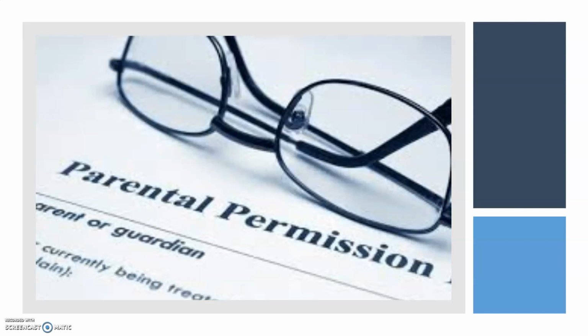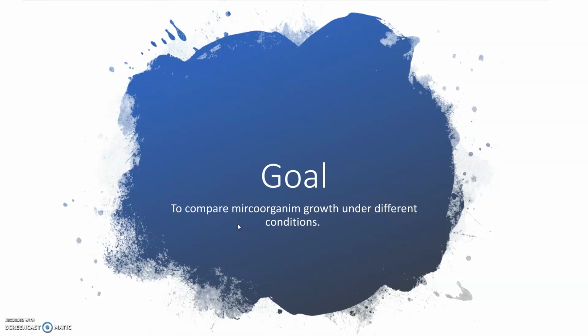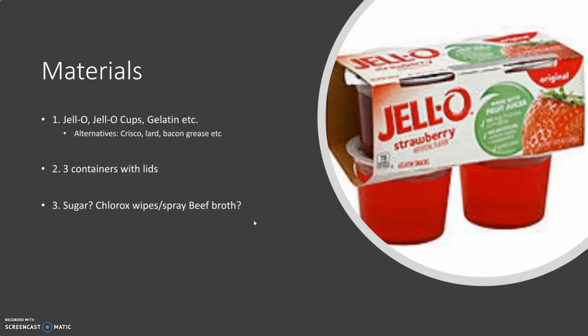The sooner the better, because this will take a few days to get through. I think the time-intensive part will be the beginning and the end, and then the middle, you're just taking pictures, so it'll be all right. All right. So our goal is to compare microorganism growth under different conditions. And we're going to start, you want to brainstorm about what you want to do as far as your hypothesis. And, oh, sorry, I don't even know my slides.